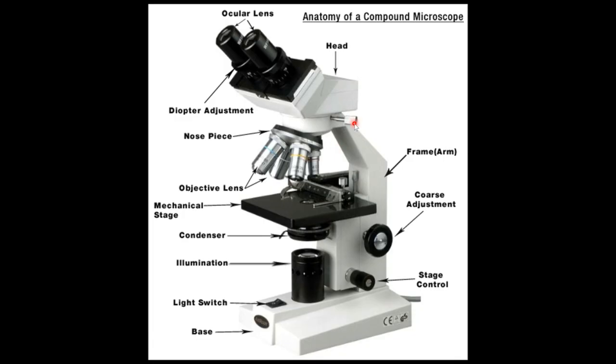As you can see, this little doohickey here, you unscrew it and you can rotate the head of the microscope. So if you want to show somebody sitting next to you what you're looking at, if you pick up that microscope and slide it across the bench, it's going to bounce, and your friend's not going to see anything. So what you do is you untwist this little knob here, and you can rotate the head, and your friend then can look in from over there without having to move the microscope.